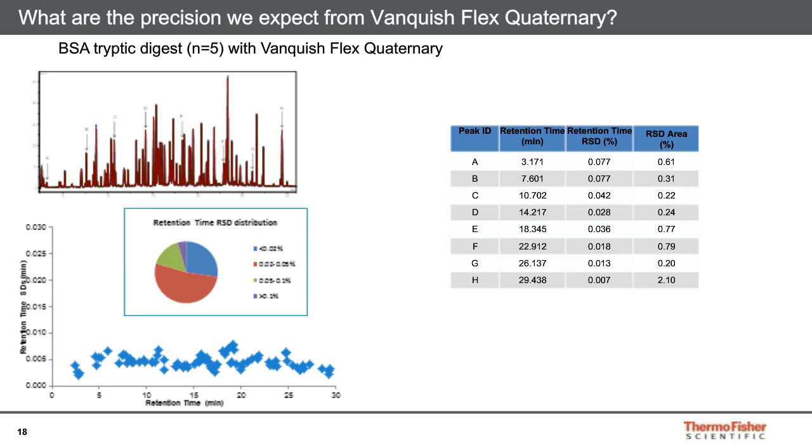Here we are talking about a very highly hydrophobic peptide eluting late in the chromatogram, and basically during the several hours of operation, this peptide was most likely sticking to the vial, and therefore the solution was depleted of this peptide. So it's not a chromatography issue, it's mostly a sample handling issue.